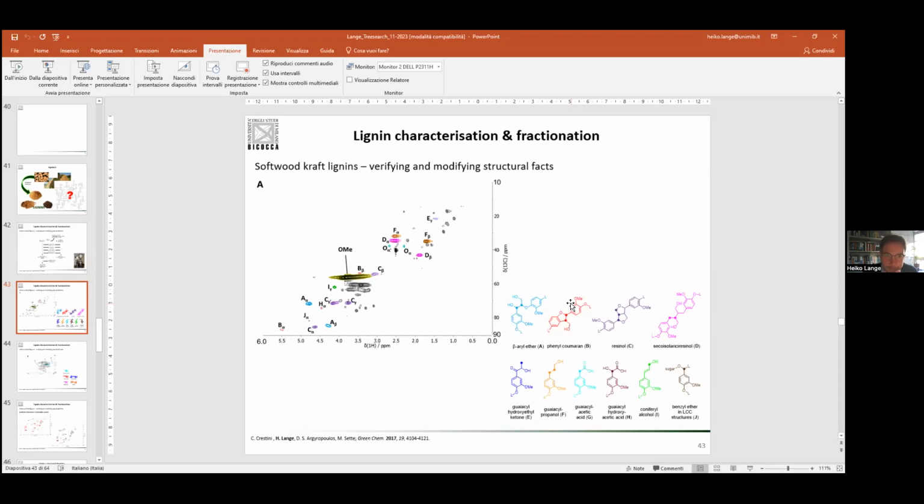Well, I mean, the HSQC 0, this back extrapolation, you can do it when you see the signal. If you're doubtful whether there is a signal or not, then if even in a standard HSQC you hardly see the signal, then the extrapolation will not help you, because you will lose the signal in the other two.